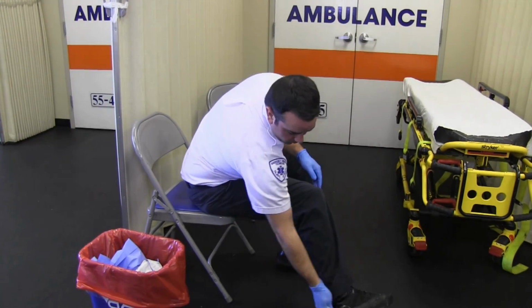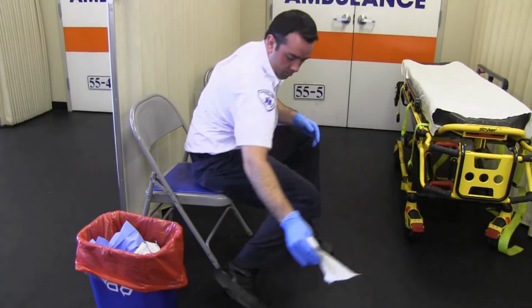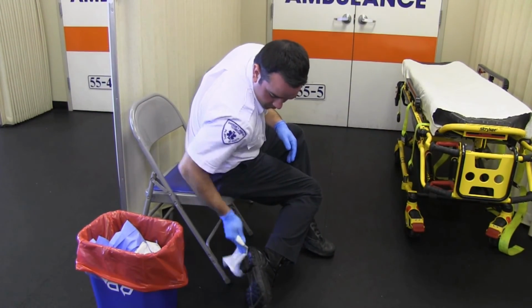Now you will disinfect your boots. Sitting on a new, clean surface, use an EPA-registered disinfectant wipe to wipe down every external surface of your boots.